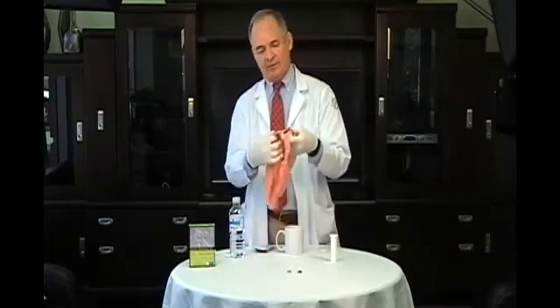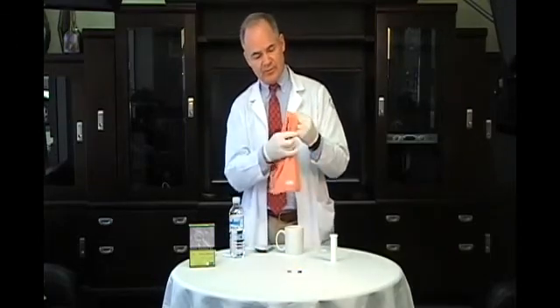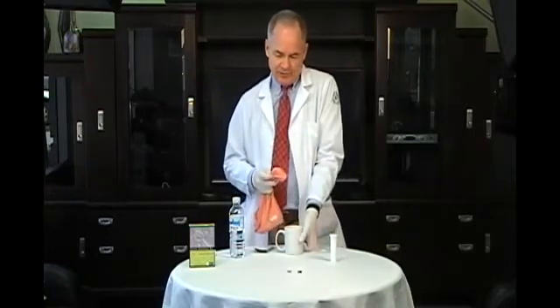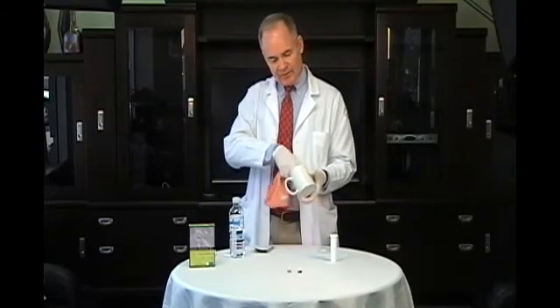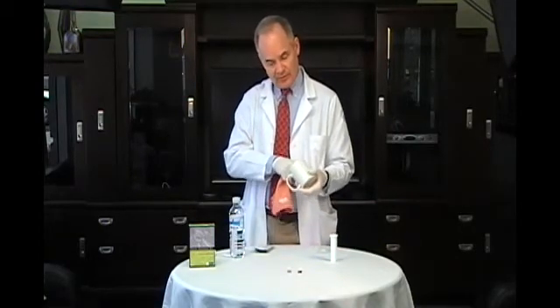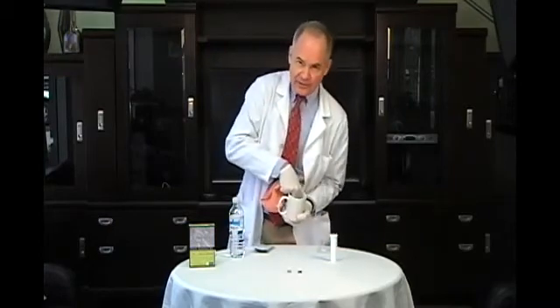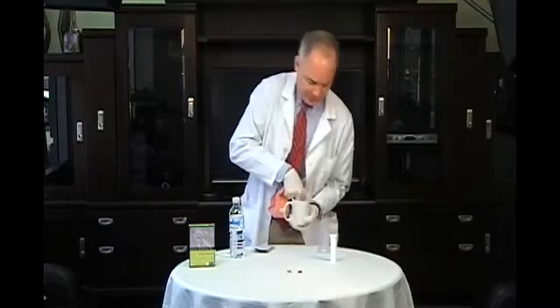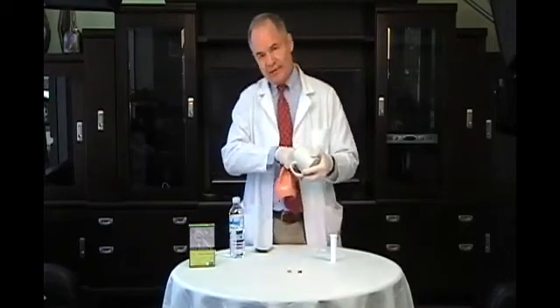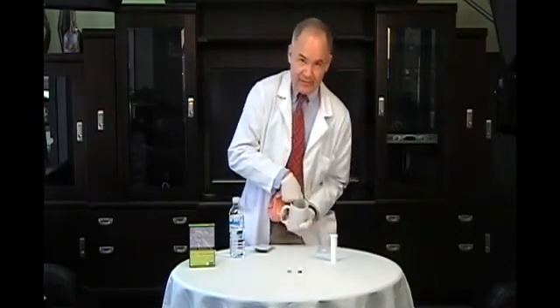Now take the garment, turn it inside out so that the inside of the crotch faces outwards. Grab the crotch between your thumb and forefinger and place the underwear in the water inside the coffee cup and let the water soak in to the underwear and then squeeze it out. Soak in, squeeze out. Soak in, squeeze out. What we're doing is extracting all that we can that's water soluble from the stain that's on the underwear.